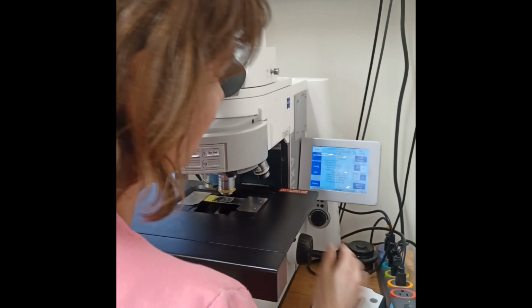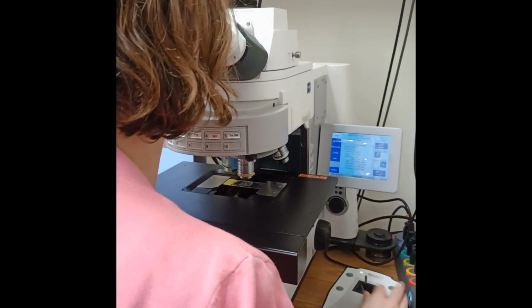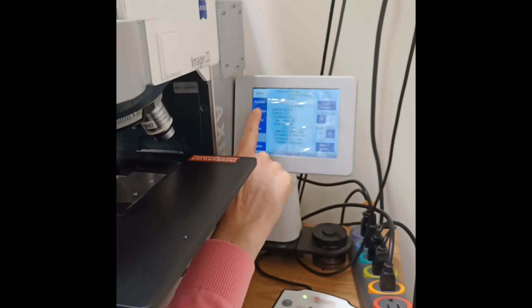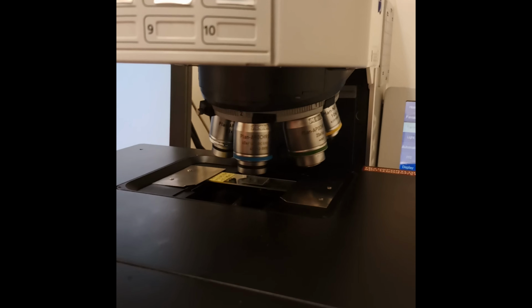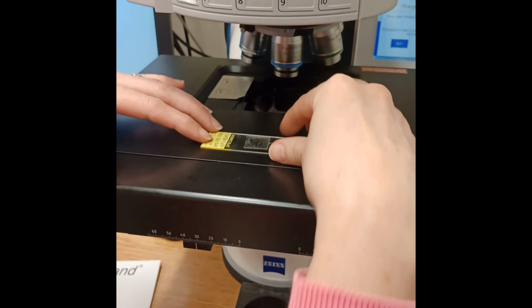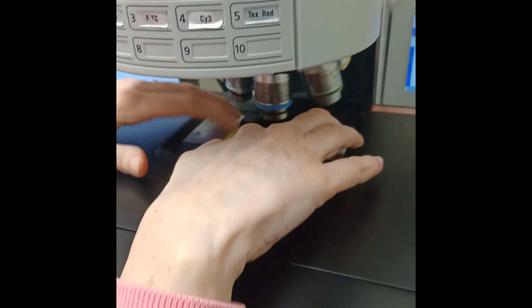If you wish to image at a higher magnification than 10x, make sure you only apply immersion oil to the correct objectives. If you forget which ones use oil immersion, tap the microscope tab on the display, but always use the software to switch objectives. To use the 40x, slide your sample out, apply a drop of oil on your cover slip while the stage is in the loading position.